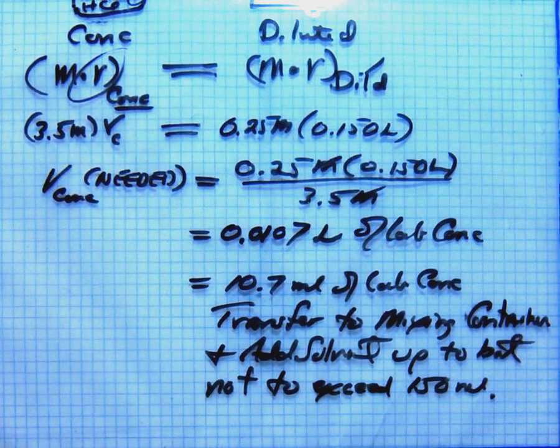And no matter how hard you try, you can't prepare exactly what you think you're trying to prepare. You get close, but you can't. So what do you do? You verify. You have to verify this one.